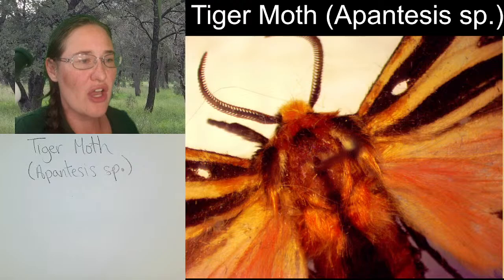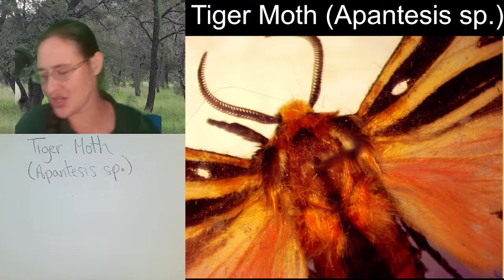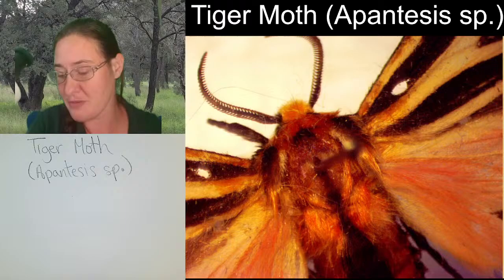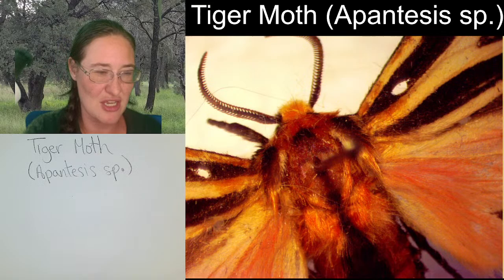So, Susan, you had mentioned that your ulterior motive was looking at the legs, and looking at it from that direction. And, you know, I'll admit, we haven't really turned too many of these over and looked at them from that point of view. But this specimen might be an okay one to do that with because it's a smaller moth. Sometimes the really big moths, I have a hard time turning them sideways and manipulating them because the wings get in the way and they're so fragile and I don't want to break them. But this one, I probably could stand up without any issue. So, I might have to do that.